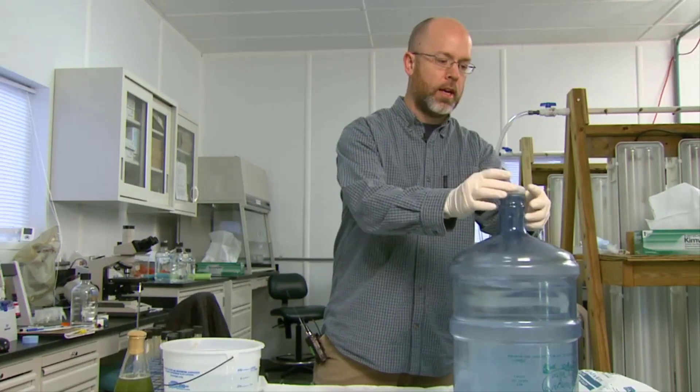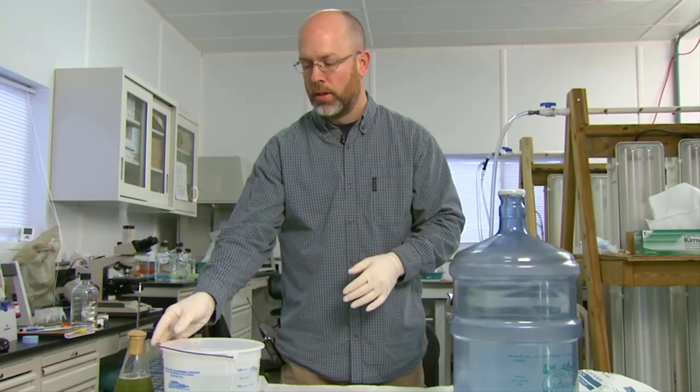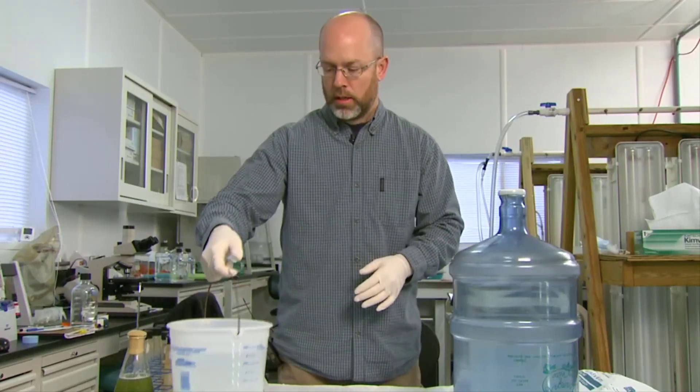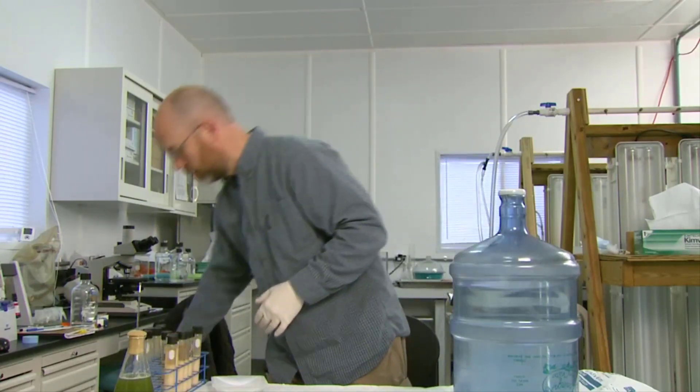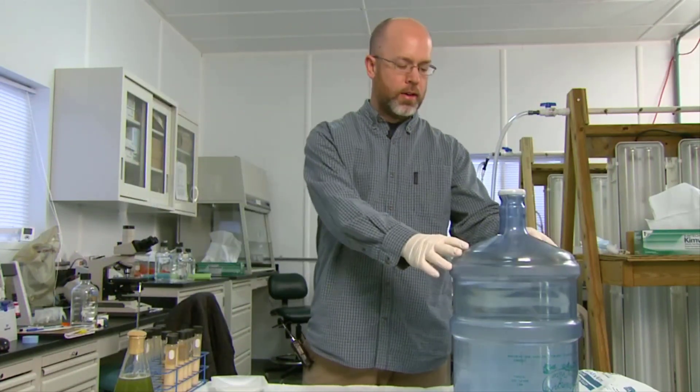As soon as you do that, get that cap back on top — you don't want anything going back down into the culture. At this point, just get this water out of the way. So what we have now is about 16 liters of water, and we still have the Clorox in there, so we need to neutralize that.